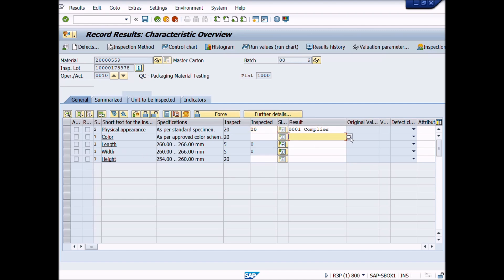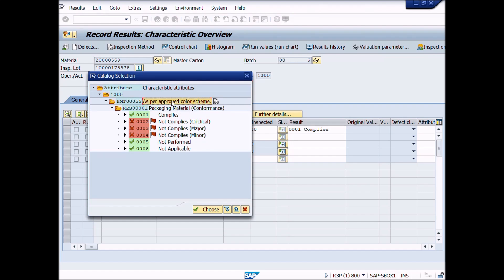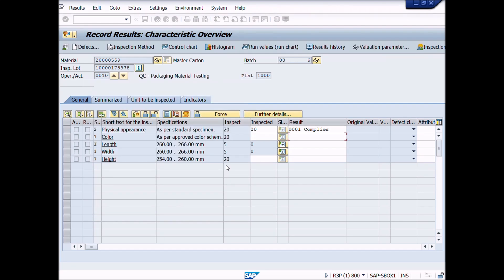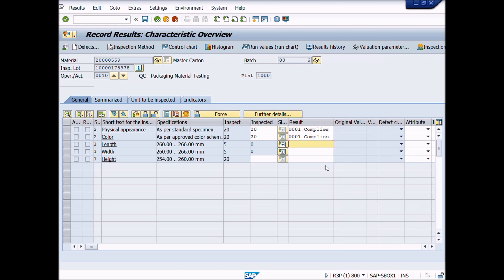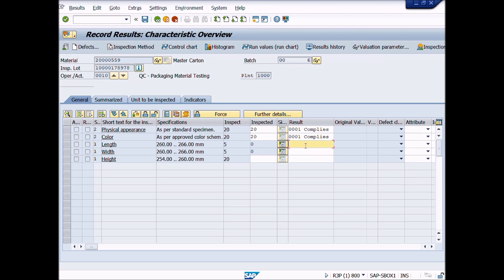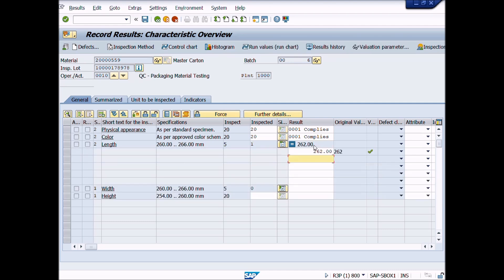Now we will enter inspection results for numeric or quantitative inspection characteristic. At the time of creation inspection plan, we have chosen single results recording parameter. So you can see plus sign is enabled. It means that you can enter multiple results values for this inspection characteristic according to your inspection results. After entry of first value, plus sign button expands automatically, you will enter more result values as you defined, like this.